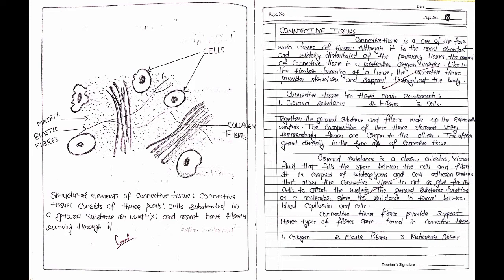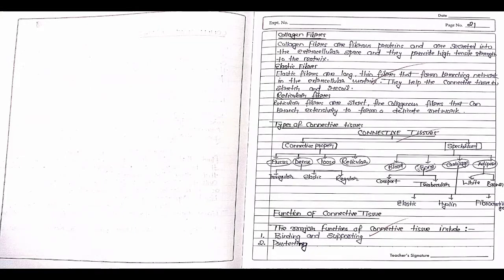Like the timber framing of a house, the connective tissue provides structure and support throughout the body. Connective tissue has three main components: ground substance, fibers, and cells. On the next slide we see the fiber types.